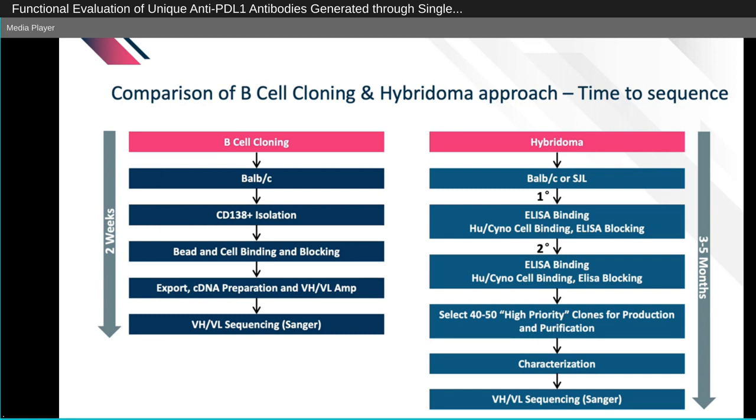Of course, we got the characterization information, but at that point, we are using all of the characterization data to select top candidates before doing the sequencing. And by not having that sequencing information, it can create challenges later in the event that top candidates are not as diverse in terms of sequence as perhaps you would have liked, if we would have known the sequences earlier.